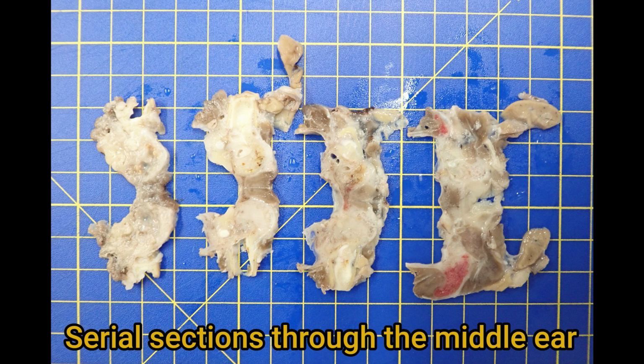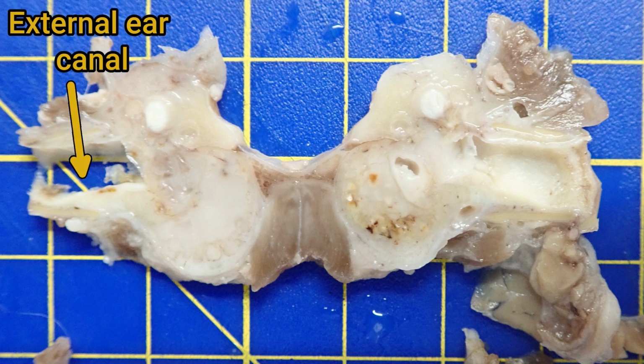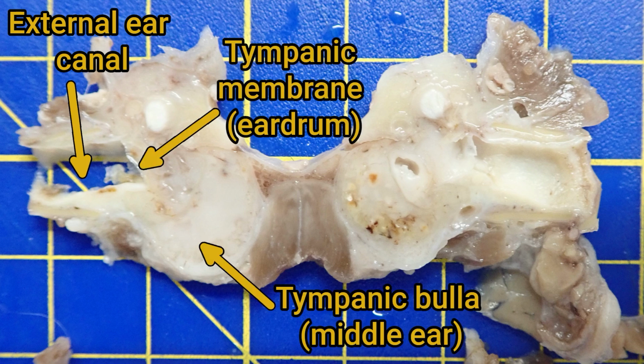In this image, you can see that the tissue has gone brown and grey from the action of the formalin. You can just about make out some of the structures. For example, here is the external ear canal with the eardrum and the middle ear. You can see that the middle ear is filled with material, but the external canal is clear and healthy.